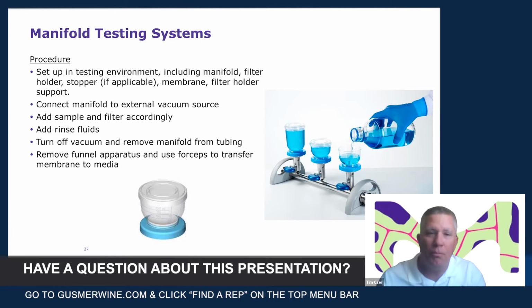Some people have a 2-pump system with 2 flasks. Our pump eliminates that, which is really nice. Other people just have old systems that have worked forever. That's fine. You might end up having some contamination issues with your manifold if you don't clean it regularly, particularly because we're looking at wine, which is organic material that's going to support the growth of biofilms and other bugs. So be sure you're cleaning that manifold.